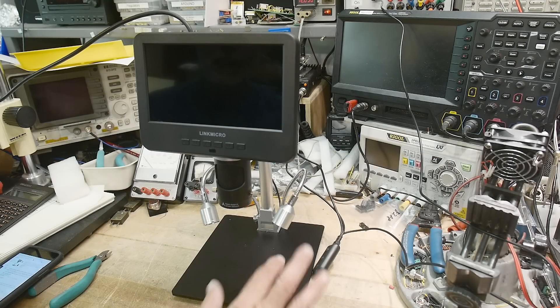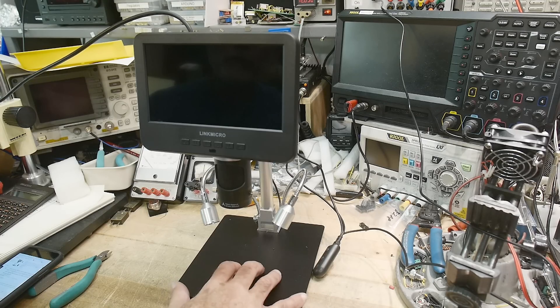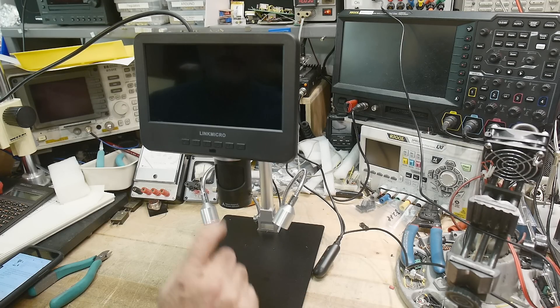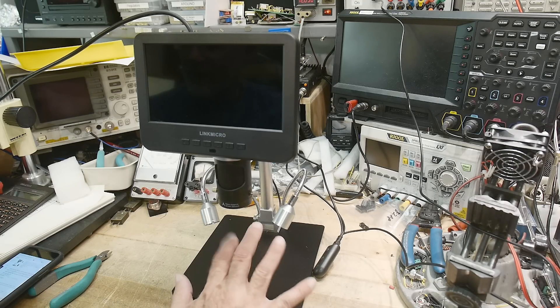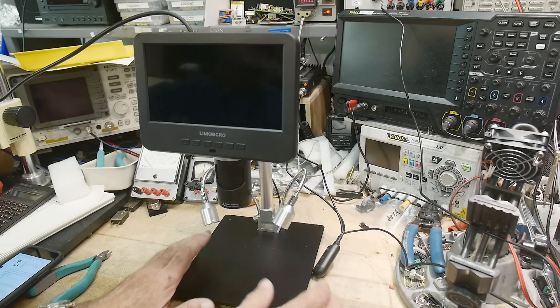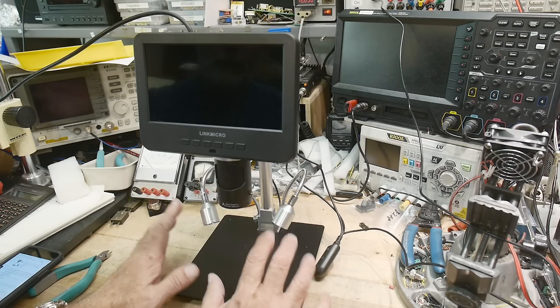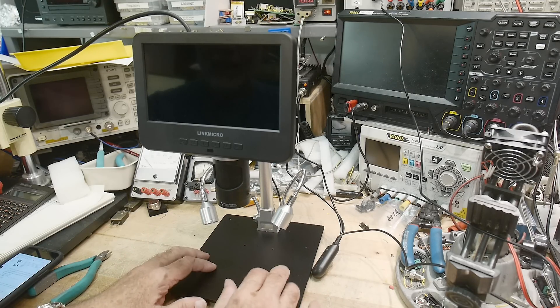Alright, I have a review today. This was sent into the channel for a review, and it's from the company Link Micro. They are on Amazon — I'll put a link down below. This microscope is around $190, and the reason I wanted to review it is because I use microscopes all the time in the lab.